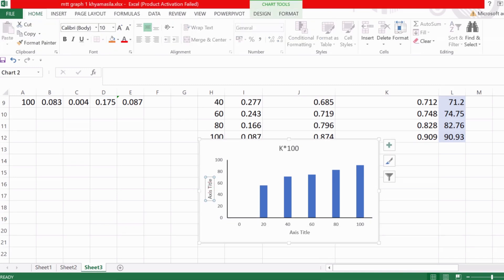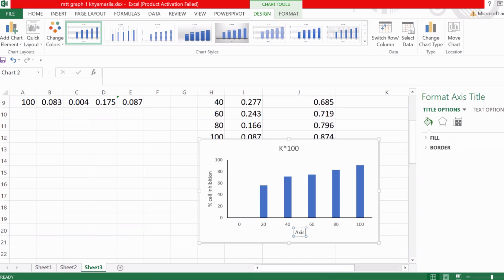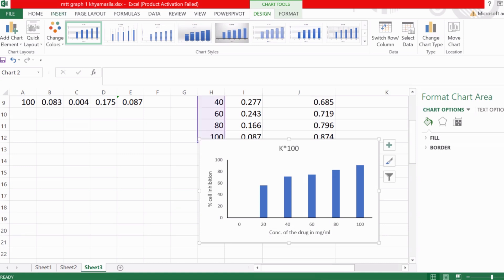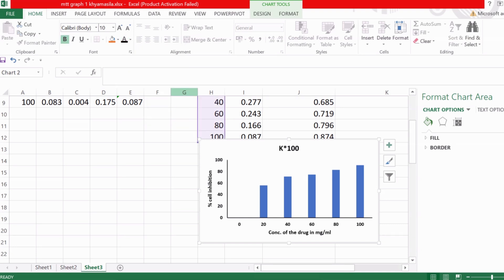The Y axis represents percentage cell inhibition, so write that as the Y-axis title. The X axis is the concentration of the drug — here we have used mg/mL, so label it 'Concentration of the drug in mg/mL.' Change the axis label color to black and bold it for better visualization. Clear out the outline for better visualization as well.